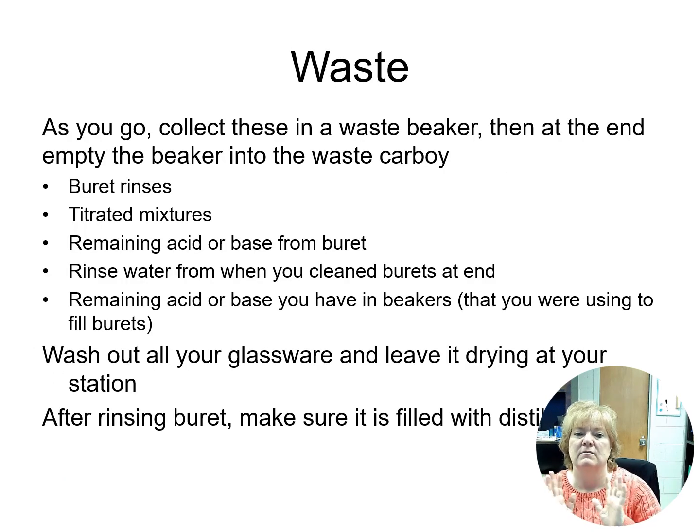When we finish, all the waste goes in a waste carboy. Make sure that you empty out your burettes, and that will go to waste. All of your titrated mixtures, pretty much everything. The remaining acid and base from your burette. If you had a beaker with extra acid or base that you're going to use to top off the burettes with, that goes in the waste. Pretty much everything is going to go in the waste.